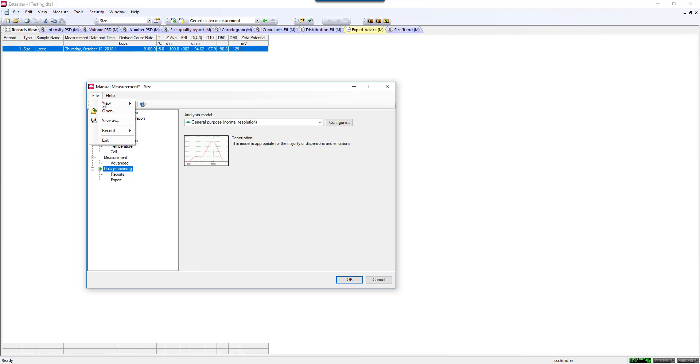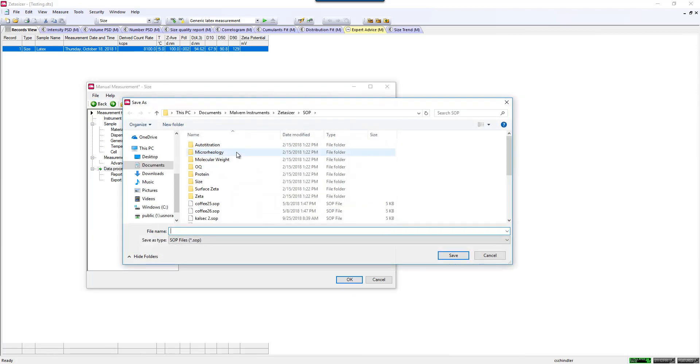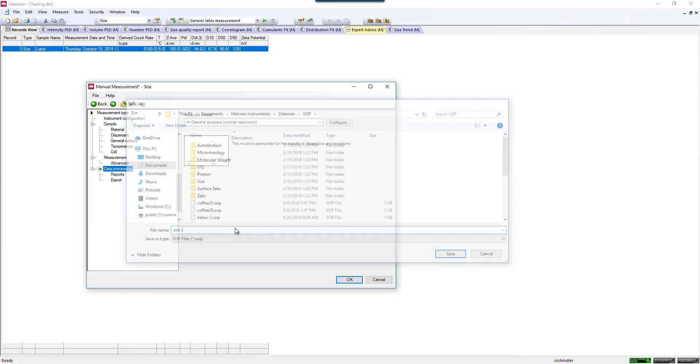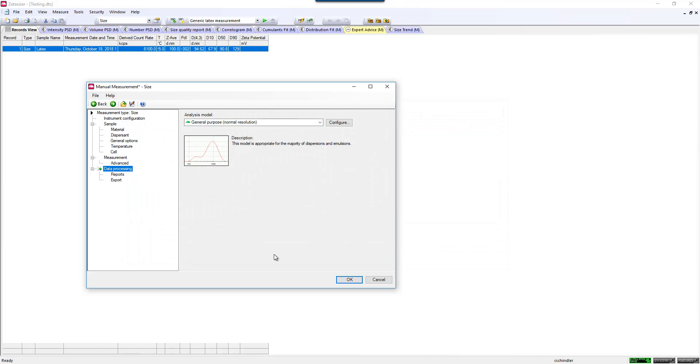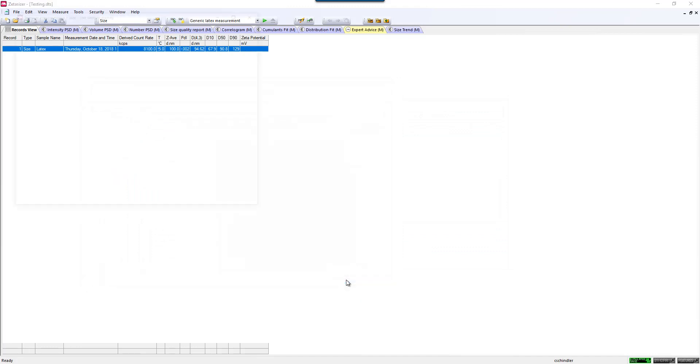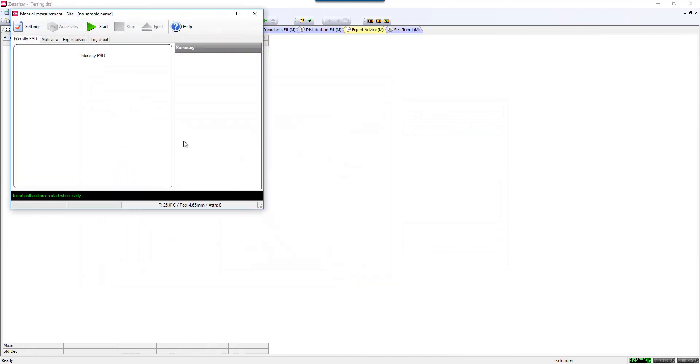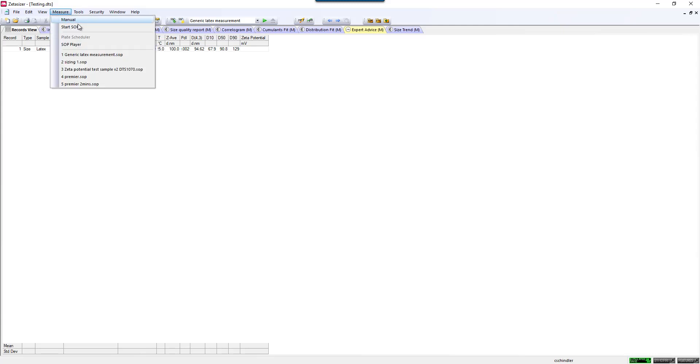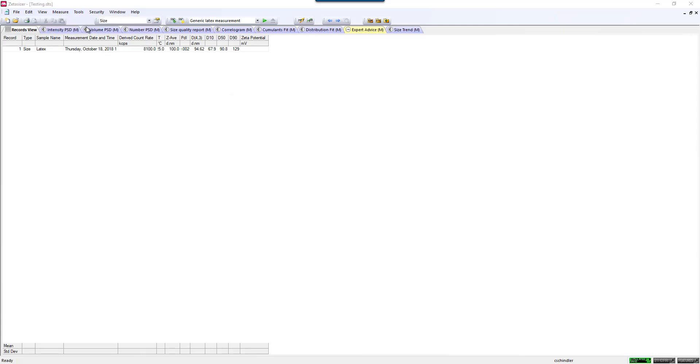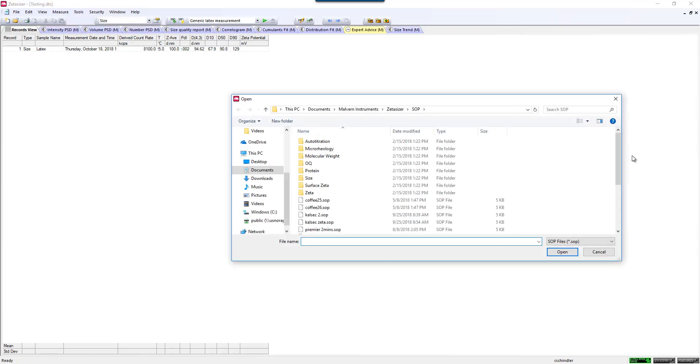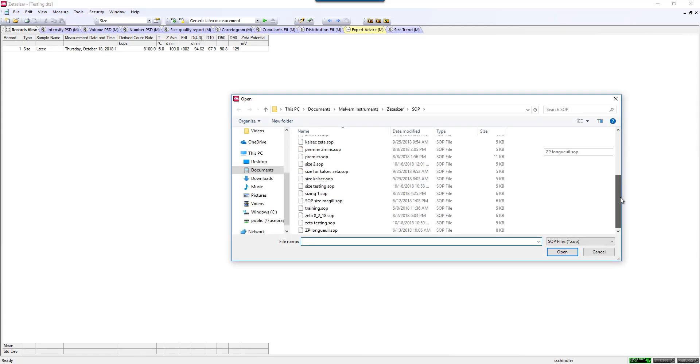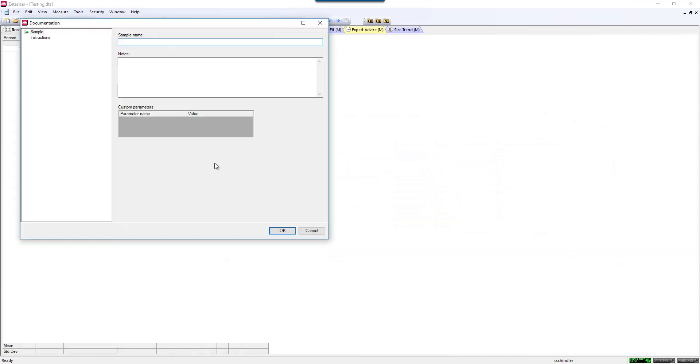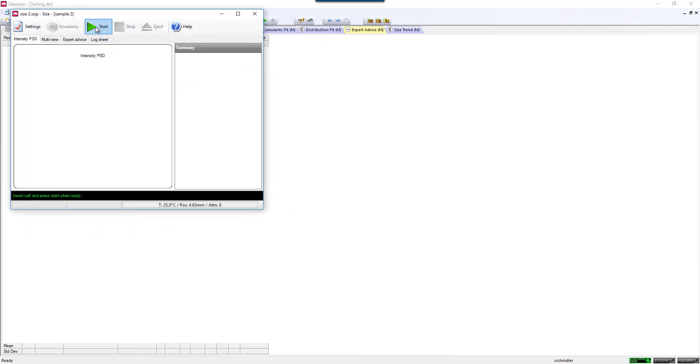If you're happy with this, you can save this, give it some sort of unique name, and then you can directly run that SOP, or if you would like to write more SOPs, you can continue writing SOPs. Once you would like to measure that sample with the SOP, you can click Start SOP, go and select your unique name that you saved it as, enter your sample name, and click Start once you have inserted the cell.